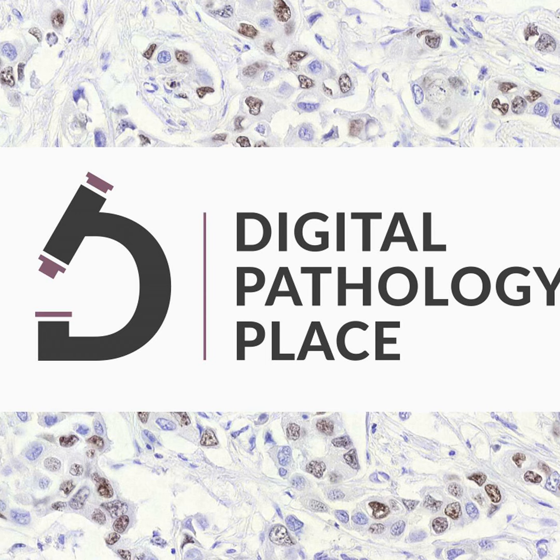The first being cell segmentation, where if you can train a deep learning classifier to understand what nuclei look like or what cells look like, then you have a nice, powerful tool to be able to go in and just do that segmentation for you with the best approximation. And remember, machine learning and AI is not magic. It's all about probability. And does this look like a cell? This is probably where the edge of the cell is to some high fidelity based on what we've trained it on.